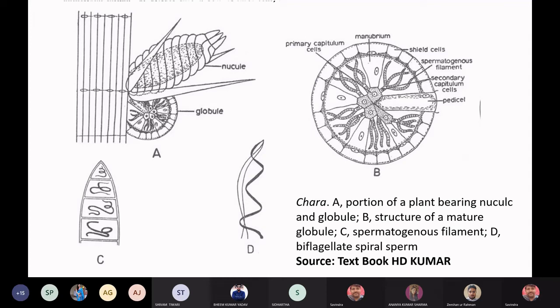So there we will see huge amount of starch. That's why it is taking more stain of iodine. Whereas the antheridial filament doesn't have to perform too much of a task, so that will not take more stain of iodine. But the antheridial filament is having mainly the chromosomal part. That's why we will stain it with the acetocarmine.